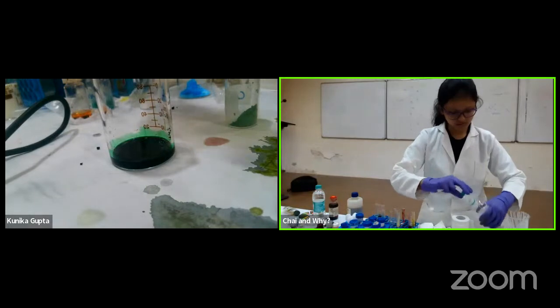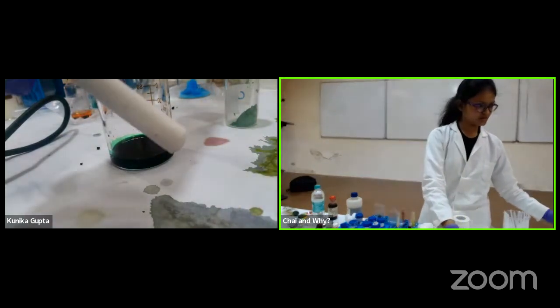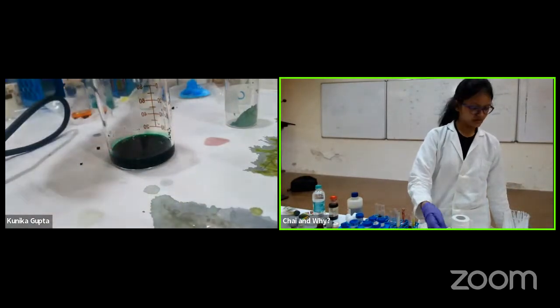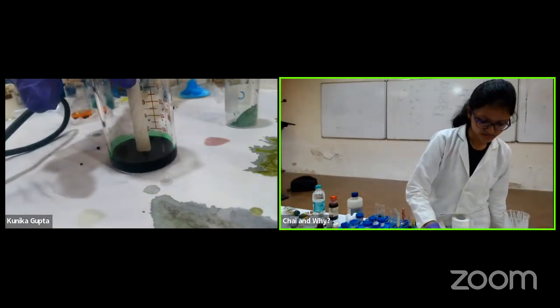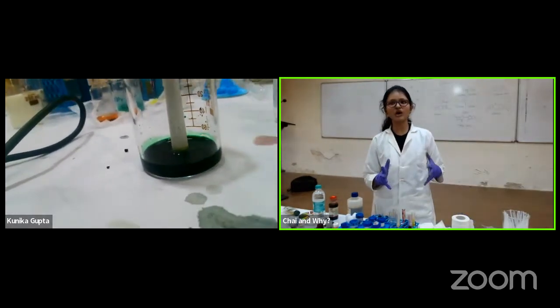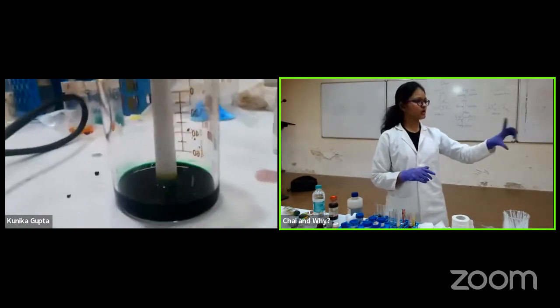Show them the chalk first. Khali chalk, dikha do. Okay. So see, this is the chalk, normal white blackboard chalk. Here is a green color which I have mixed. Abhi tak kuch nahi mix kiya hai. Now if I drop this, you want me to do something else? It's fine. Let us see if something is happening, like if there are two colors which separate out. Okay. Can I get one more small paper?